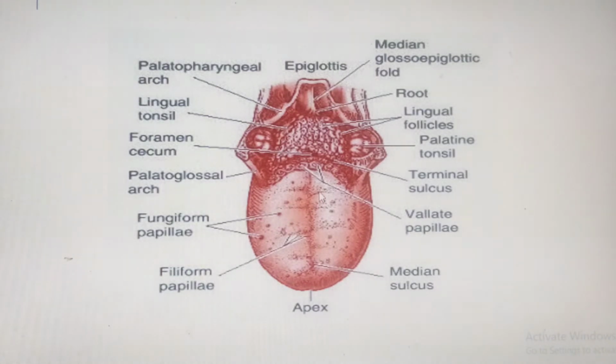Now we are going to find these four main papillae. We are talking about the circumvallate papillae. We will see also fungiform papillae. Yes, we also see filiform papillae. Then even in the newborn and also in lower animals, we may see what we call the foliate papillae. One thing that we find is that most of these will contain taste buds. Yes, these primary papillae I'm talking about will contain taste buds, except the filiform papillae.